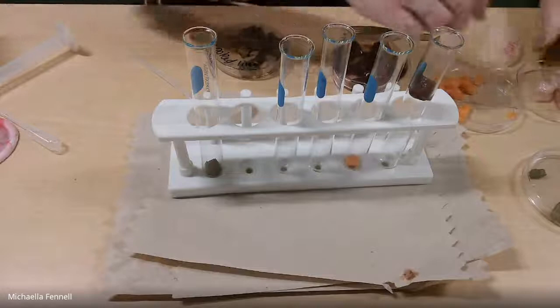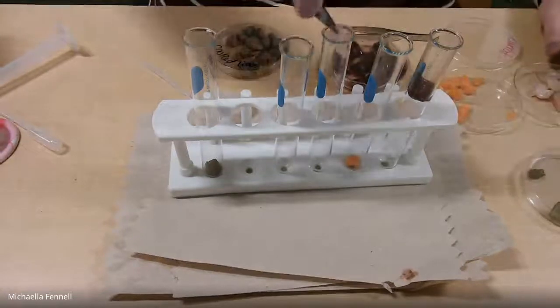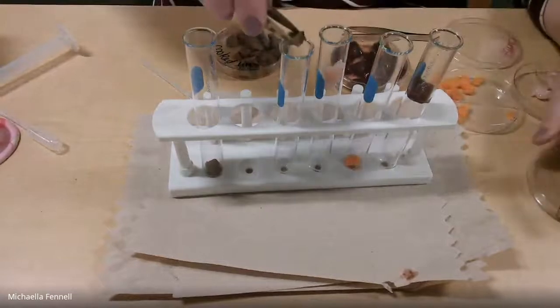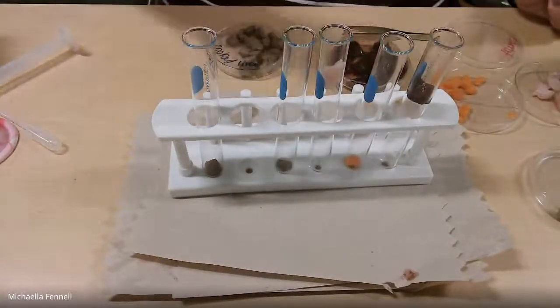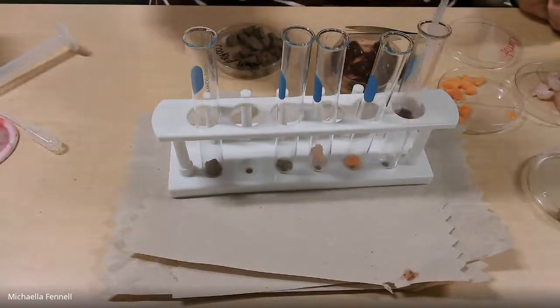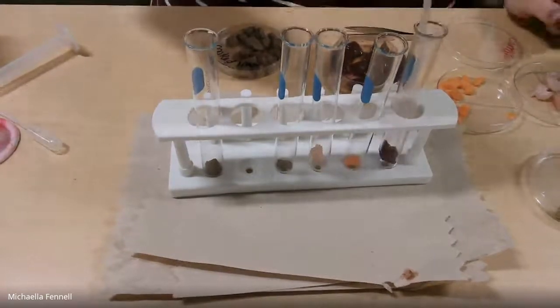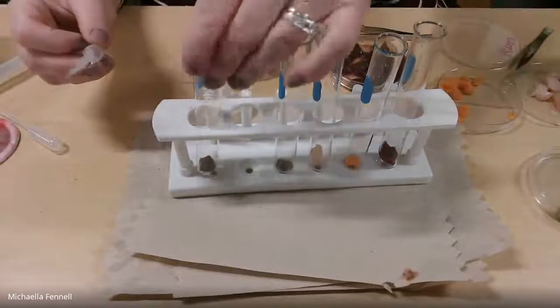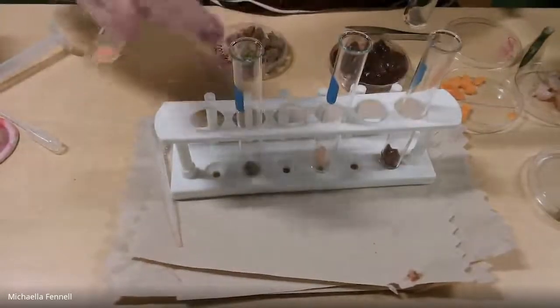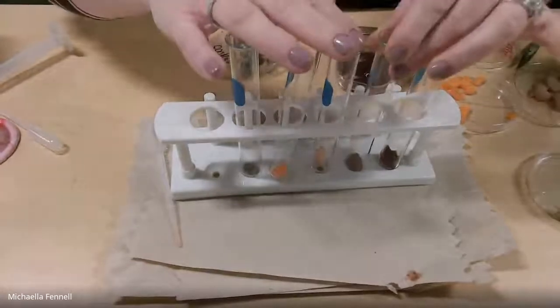Piece of chicken, piece of carrot, and piece of potato. All right, I'm going to help these two things down to the bottom of the test tubes a little bit so you can see. This is pretty straightforward. So you have these 5 different things that we're going to test. Let's do this order: we've got potato, carrot, chicken, raw liver, and cooked liver.